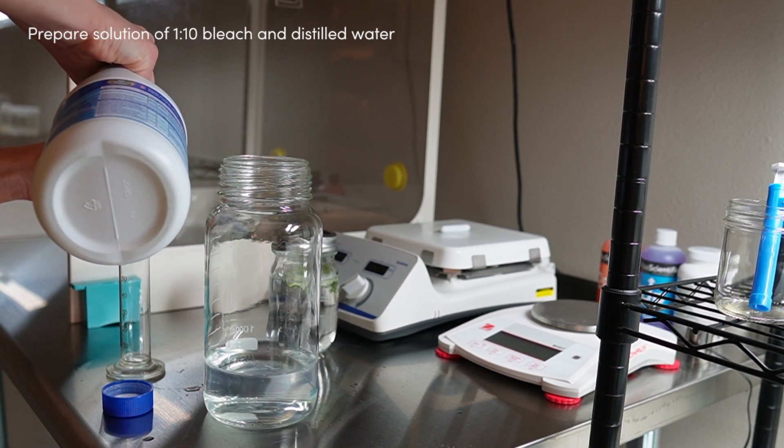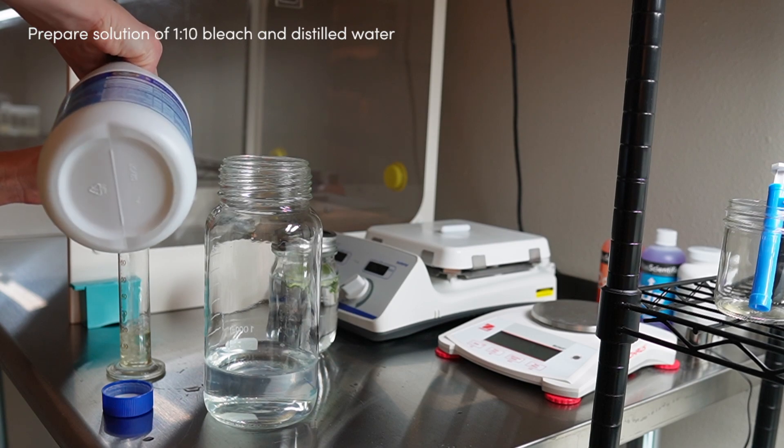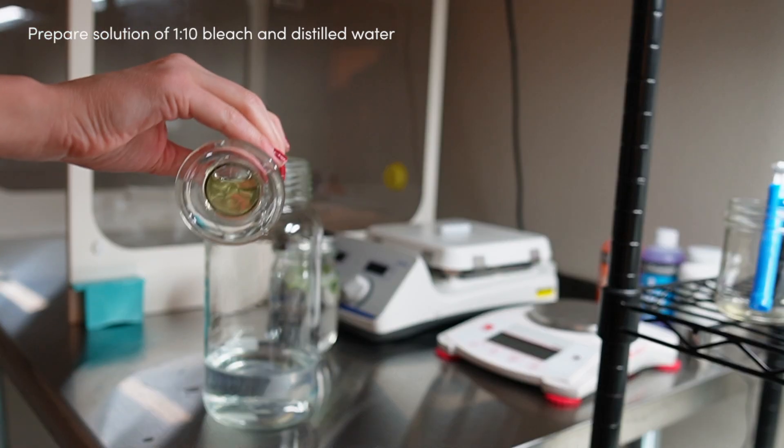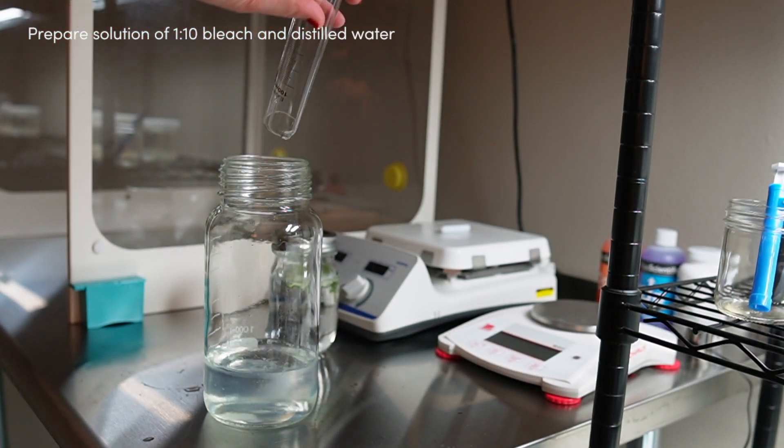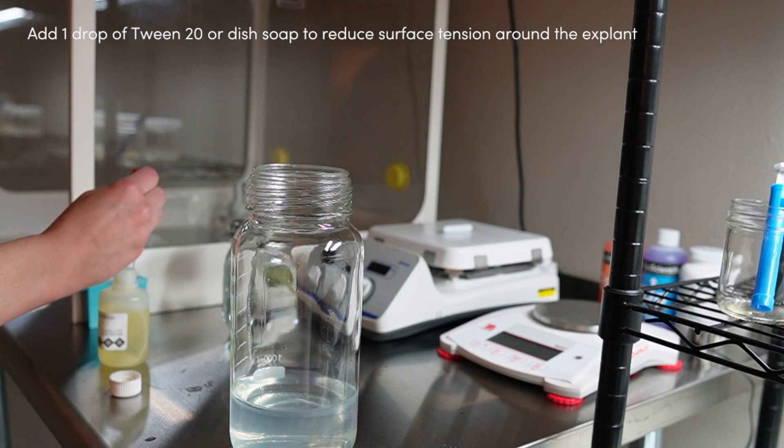The first step in establishment is to clean the part of the plant that you're planning to use for tissue culture. Now the way that you clean the plant and also the part of the plant that you decide to use for tissue culture will depend on the protocol that you're following.